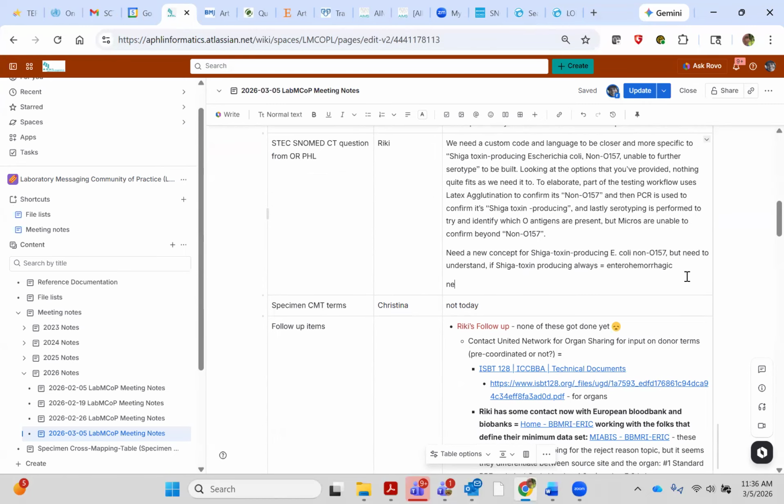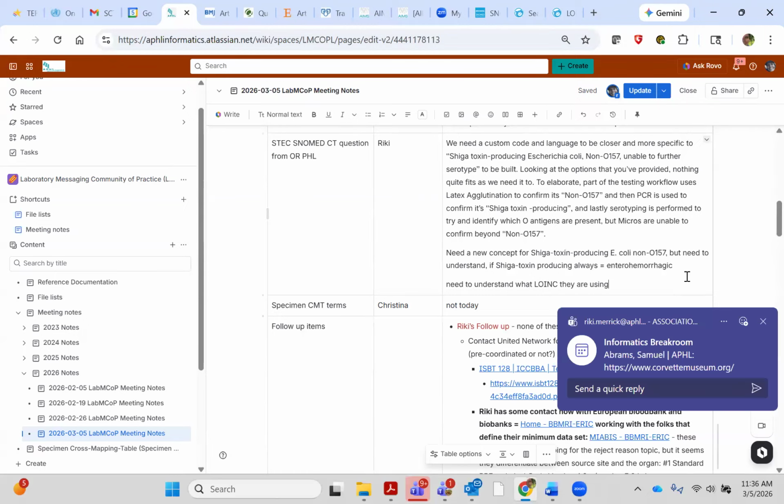And I think Ricky's highlighting that the public health labs might use that in their system, but from an LIS perspective, I haven't encountered folks that are using the findings hierarchy. It's not necessarily part of how things are reported. From a free text perspective, they might include the same phrasing, I'll say that, but the findings hierarchy is not used in laboratory LISs. It's more on the physician side of things.